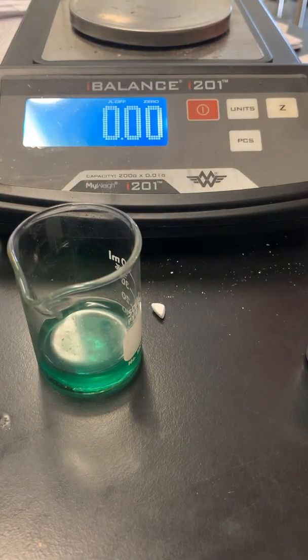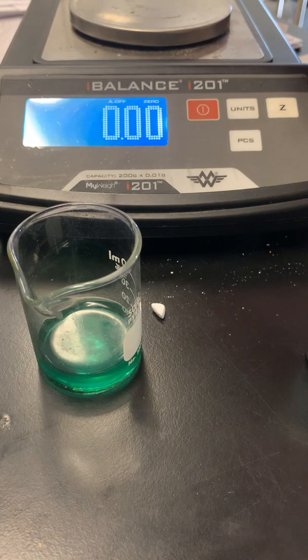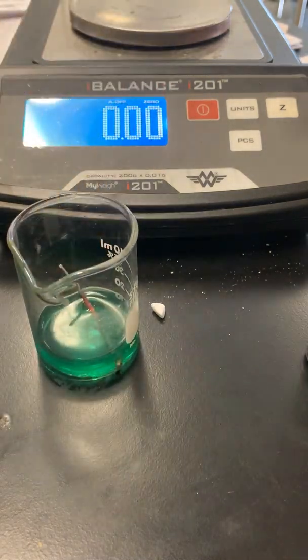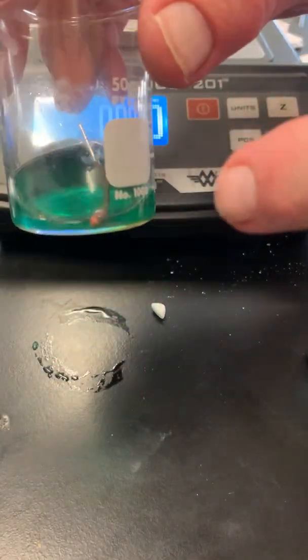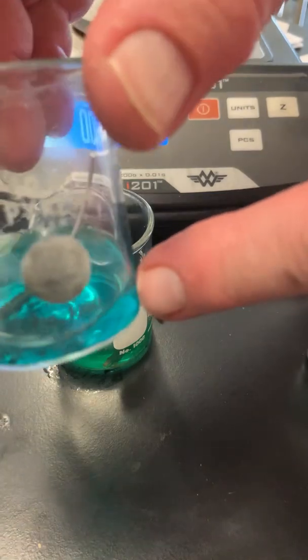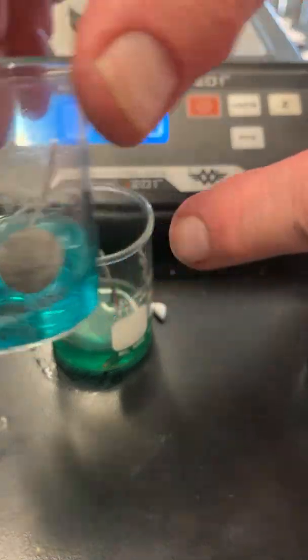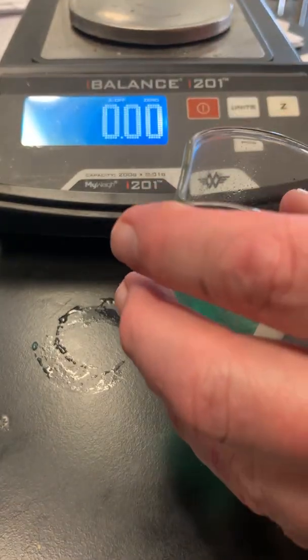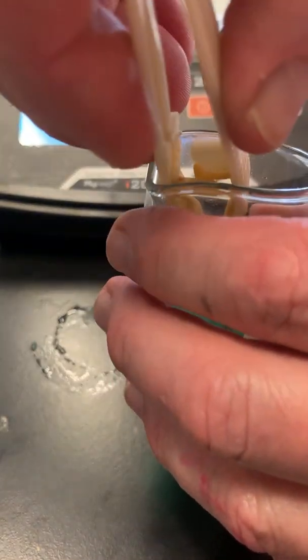Through the magic of film, this is a greener solution than what I had. This solution will continue to build up the coating, and eventually you'll get a nice coating on there.